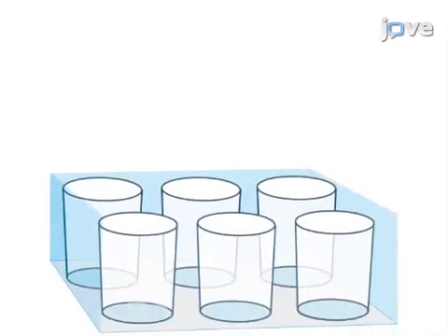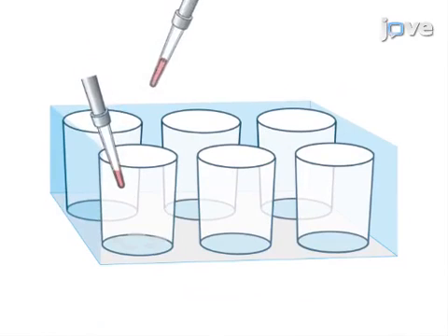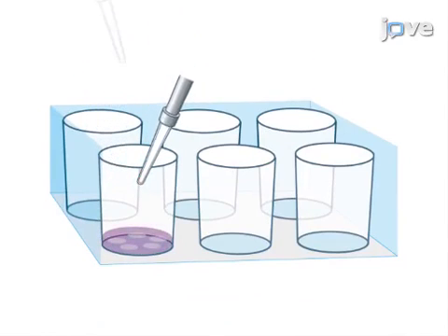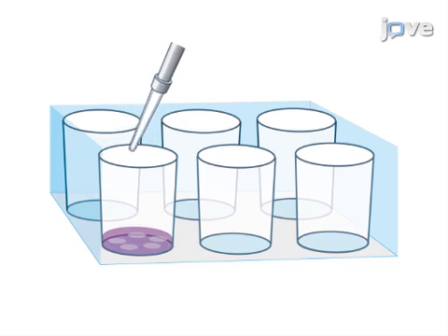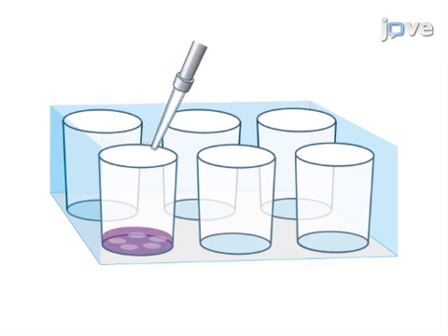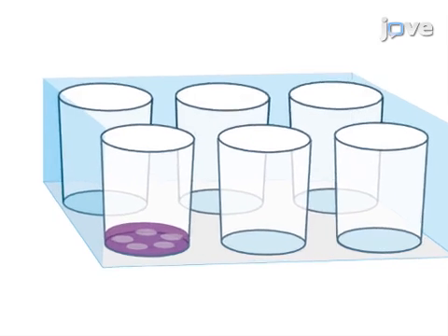This is accomplished by first treating coverslips in six well plates with polyornithine and laminin for culturing neural stem cells. Next, neural stem cells diluted in culture medium are plated using a gentle rotating pipette movement and are allowed to differentiate up to 70 days in culture by renewing the medium regularly.